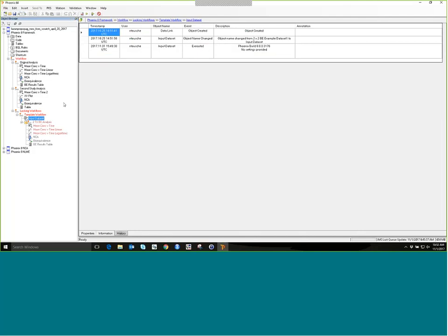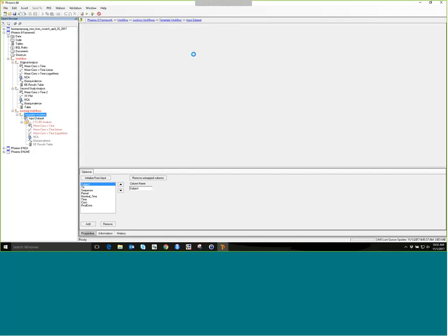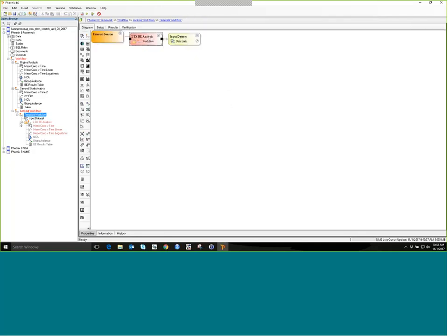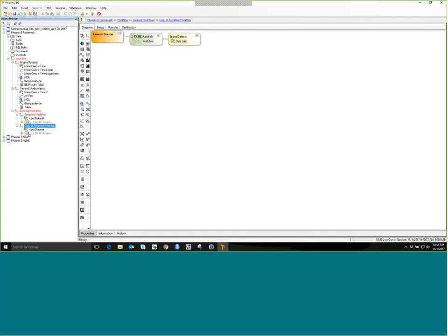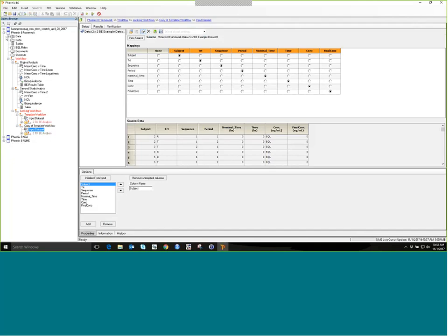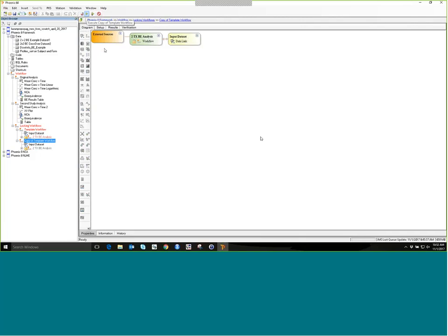The key to using it is you want to make sure that you have your data inputs outside the workflow, and then you can actually take this workflow here, and I can make a copy of it, and then I can paste it, and now I have a new workflow here that has that locked workflow in it, and I can connect new data to my input data set, and then I can be off and running. So if I compare to my data, and I put data set 2 in, and now I can run this workflow, and it'll generate new results for me with this locked workflow.